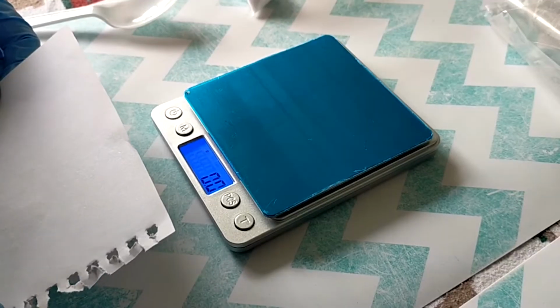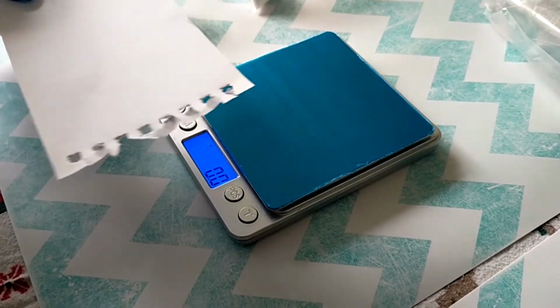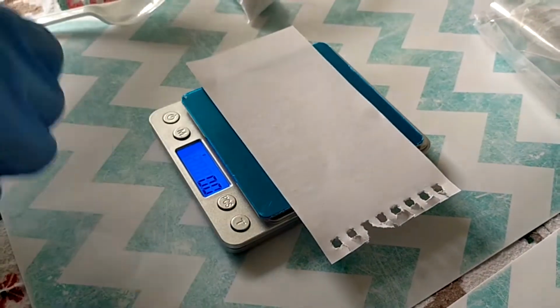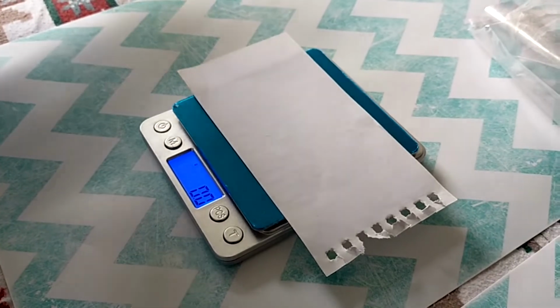First, we would want to exactly weigh our naphthalene. So I will be using this paper. And then we will tear. And then I will scoop up 1 gram of naphthalene.